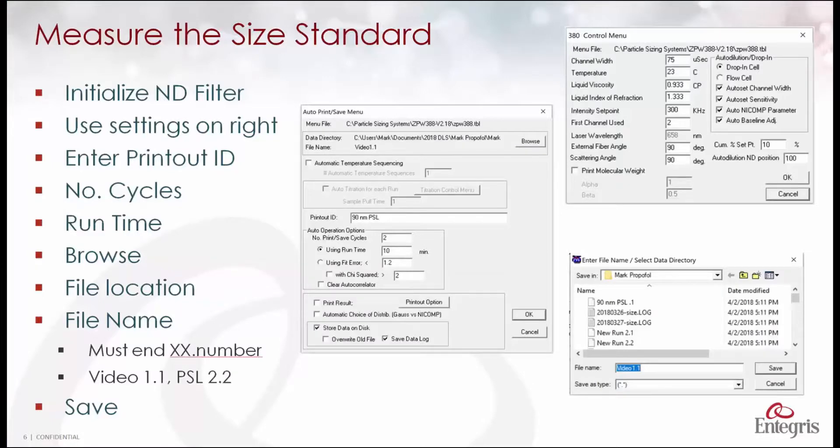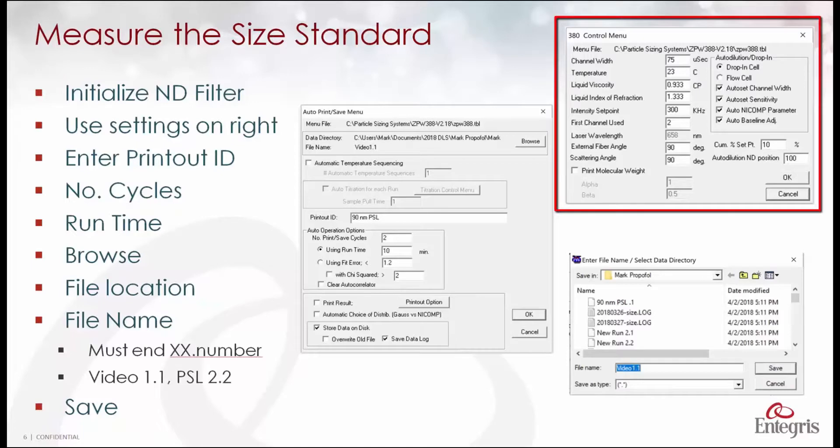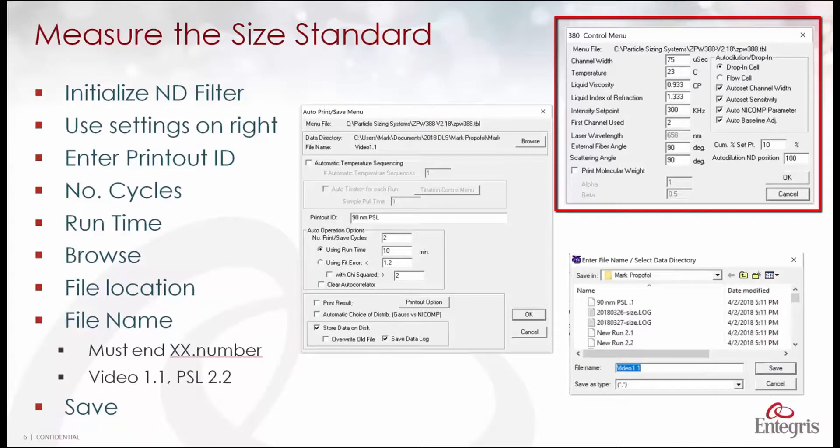Here we see the software settings for making the size measurement. In the upper right under the control menu you see we set the viscosity to 0.933. In the other settings you see fixed here. In general we leave everything on automatic until you become more adept at using the system.